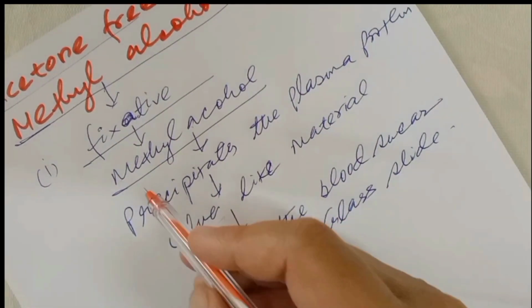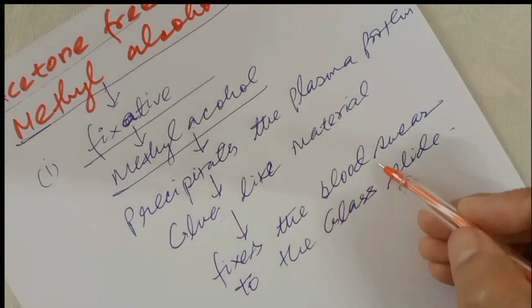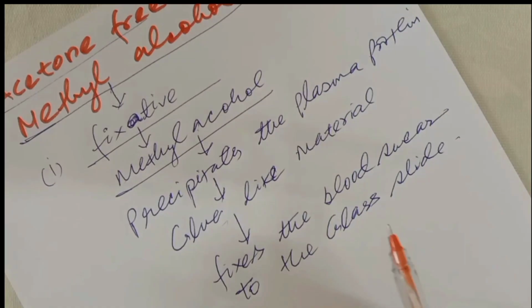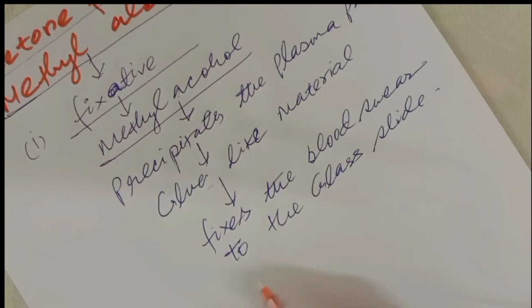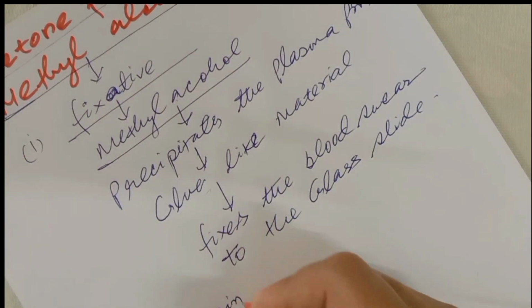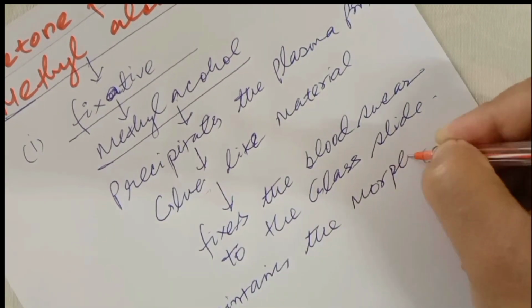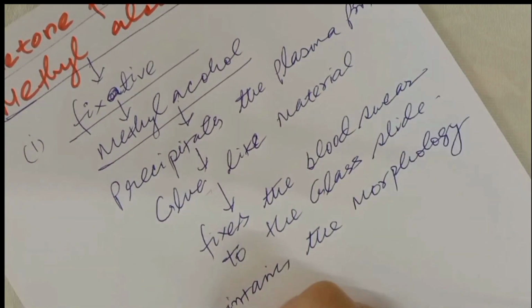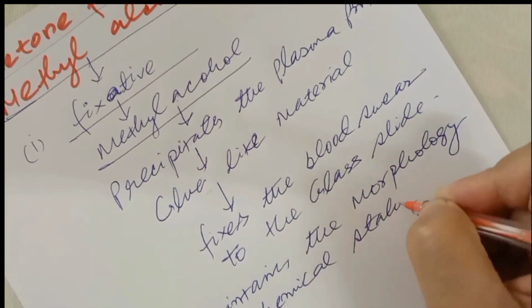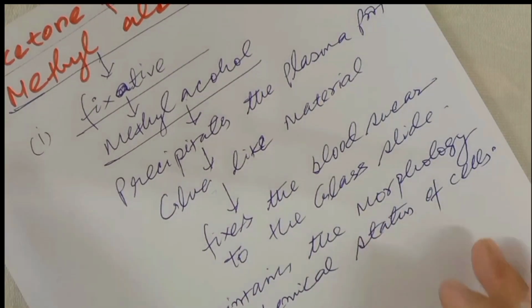So it acts as a fixative and fixes the blood smear and blood cells to the glass slide so that it is not washed away during the staining procedure. And the next function of this methyl alcohol is that it maintains the morphology and chemical status of the different blood cells.